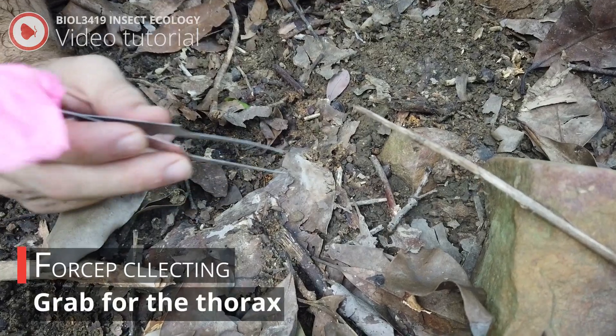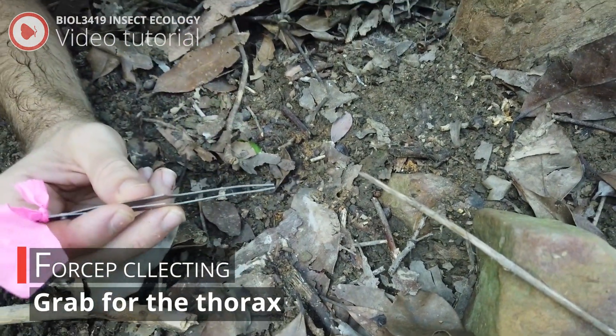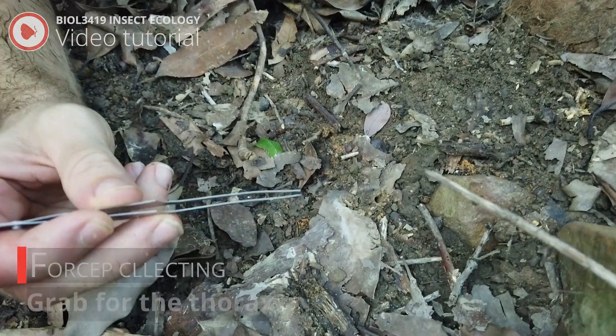When using forceps, you want to be as gentle as possible. Make sure to try to grab for the thorax and not the legs or antenna, because that might damage the specimen.